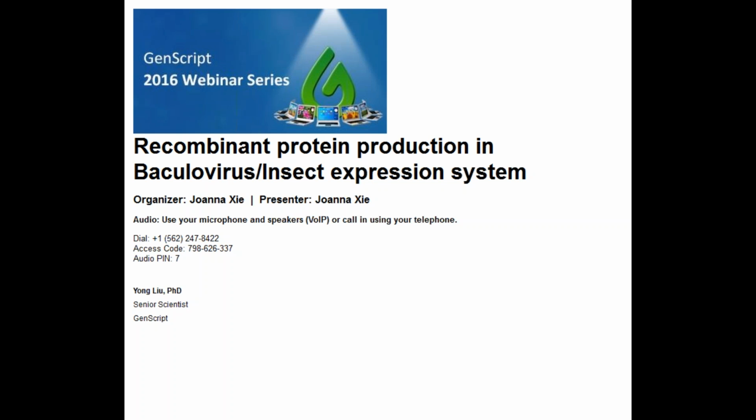Now coming to the topic, let's take a look at aspects of Baculovirus insect cell system optimization to see how one can manipulate the insect expression system. And we'll review aspects of protein production and look at some case studies later on in the presentation.